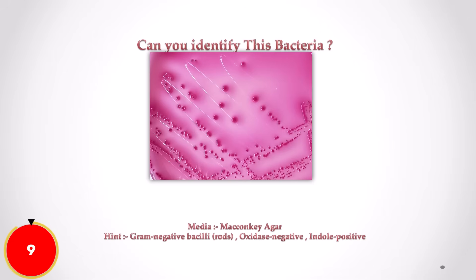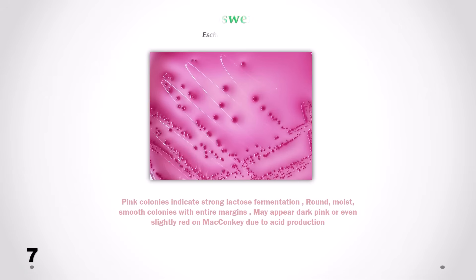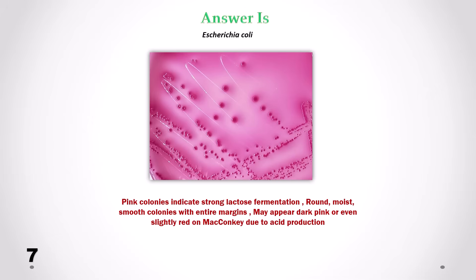Can you identify this bacteria? Correct answer is Escherichia coli. We can see pink colonies which indicate strong lactose fermentation. Colonies look round, moist, smooth with entire margins. May appear dark pink or even slightly red on MacConkey due to acid production.